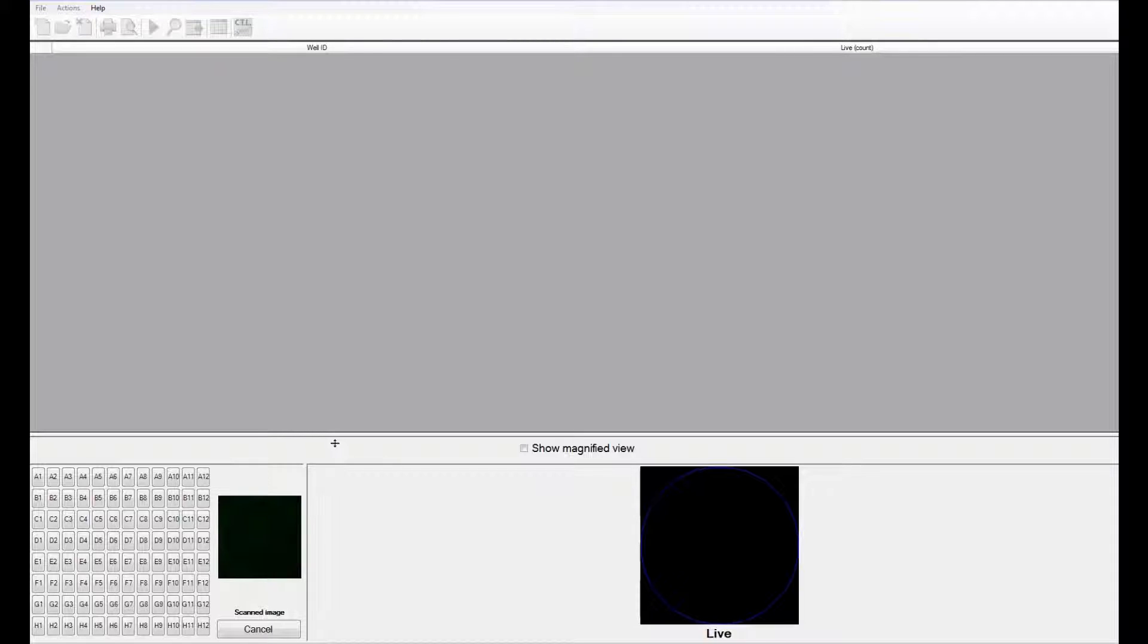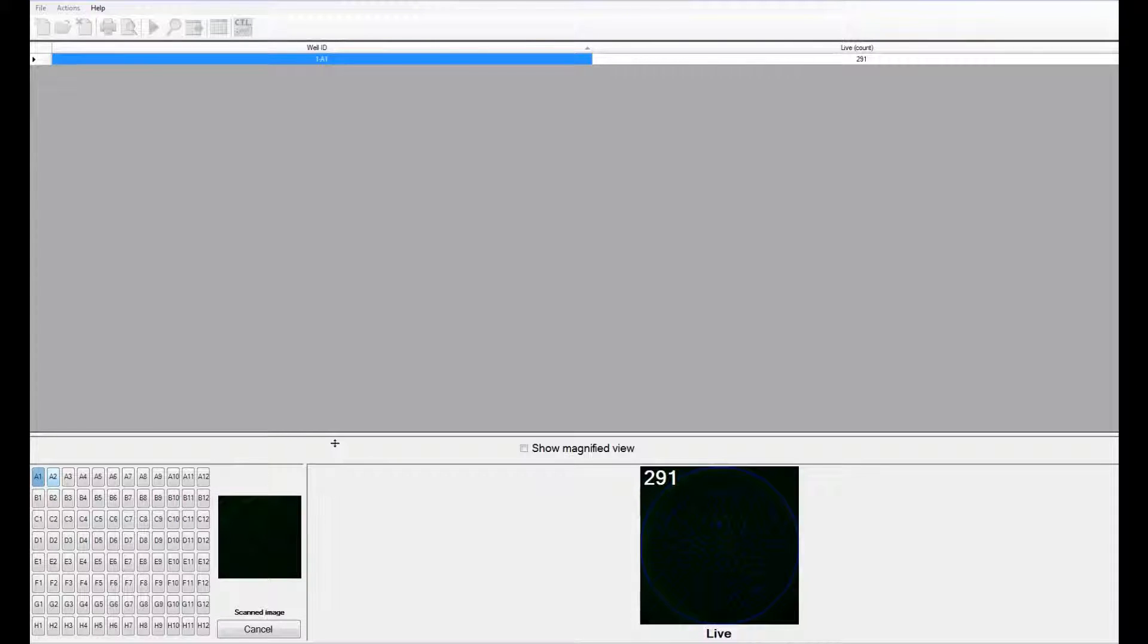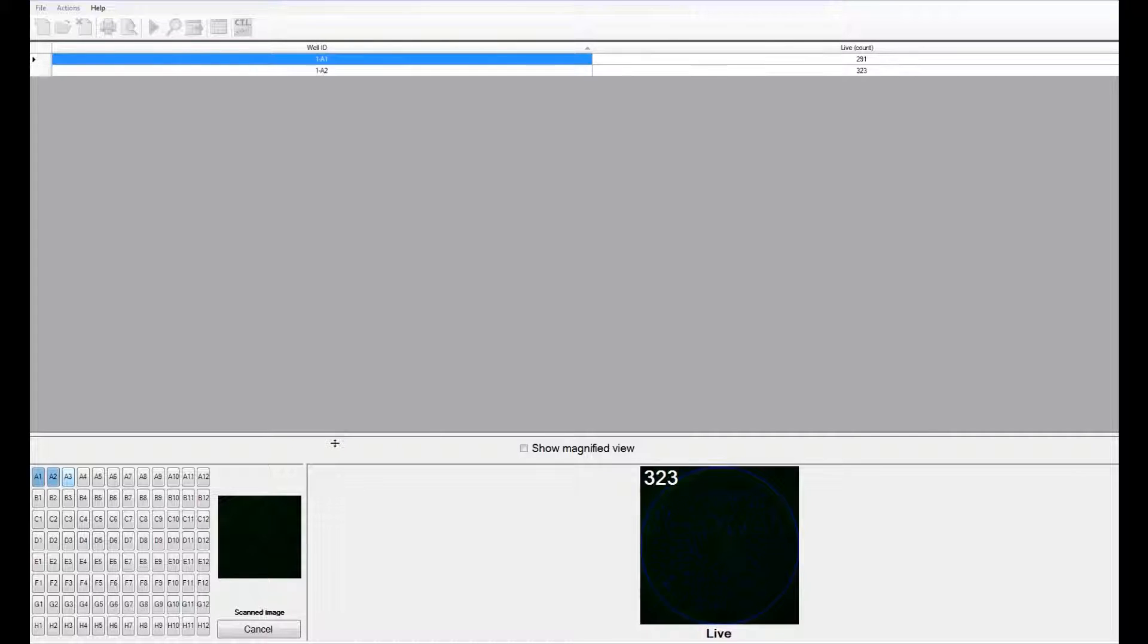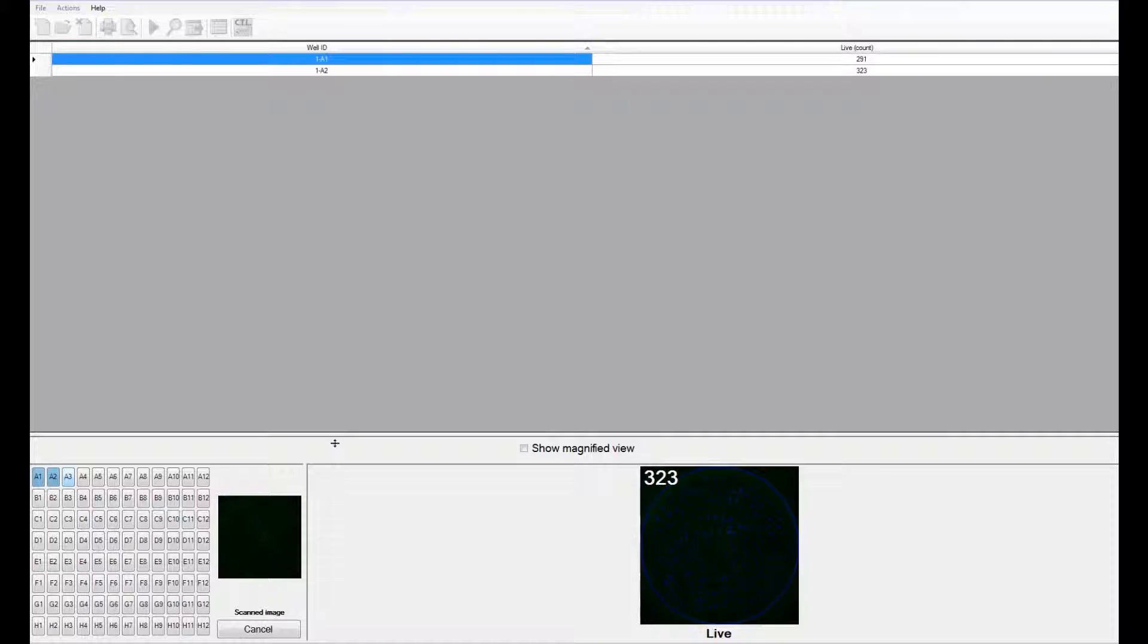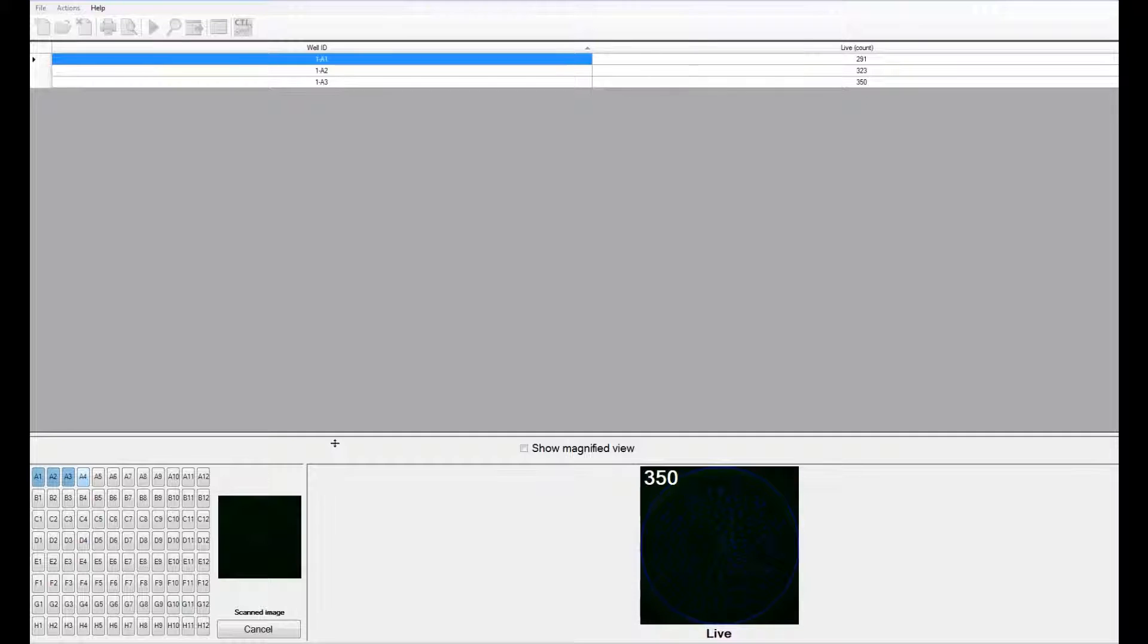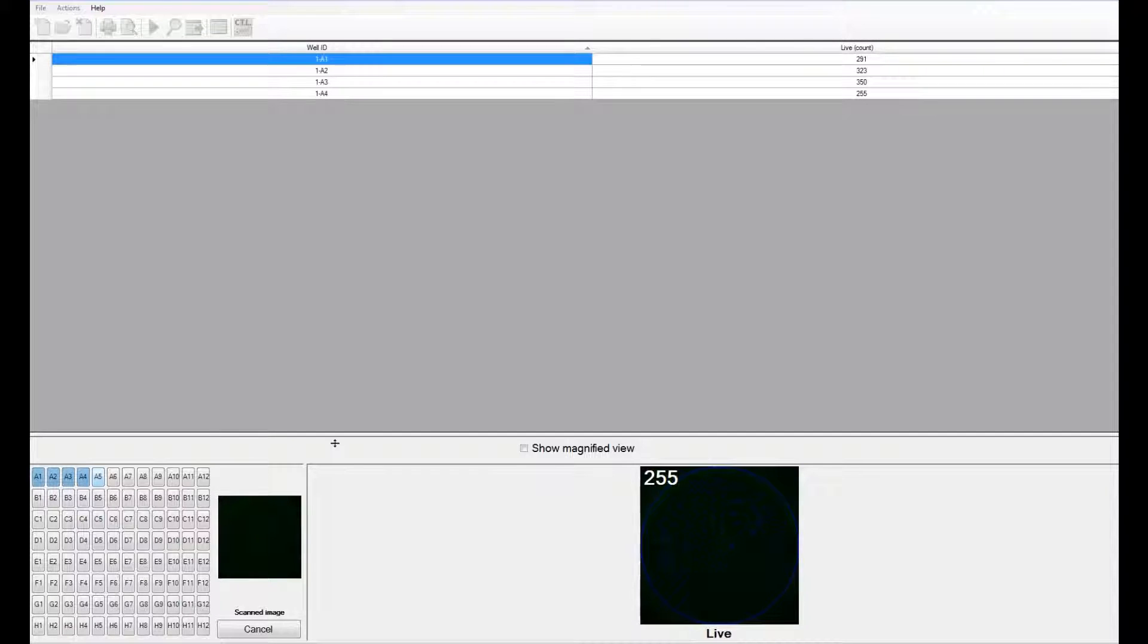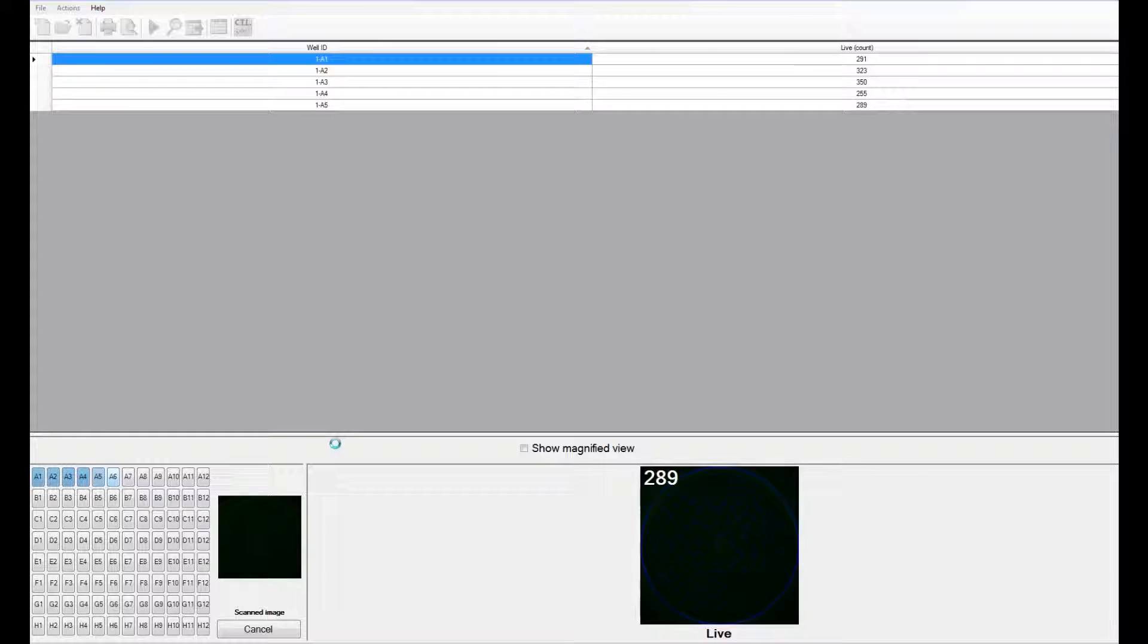You can watch the software detecting the number of live target cells in each well. The software focuses on each well, adjusts the exposure for optimal intensity of the signal, and then counts the number of live target cells in that well. The difference between the number of live target cells in the control wells and the test wells with varying values of effector to target ratio is what determines the percentage of cell lysis.